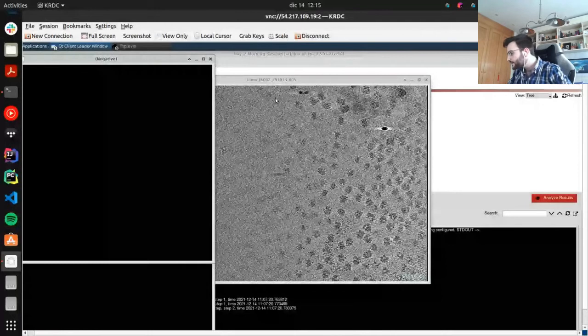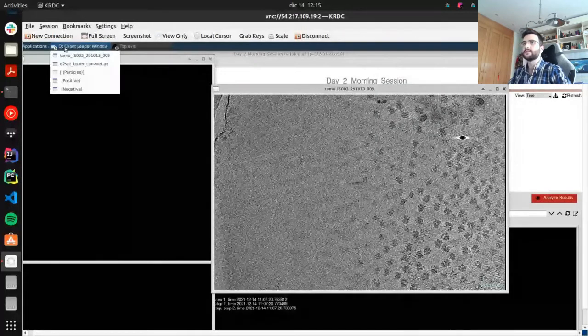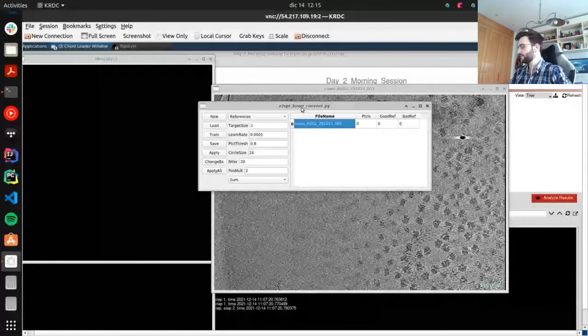I missed what you did, that the interface was... Yeah, to open the tomogram, I click on this E2 SPT window, and I click on the name that appears on this table. And after clicking it, the tomogram will open after a small period of time.